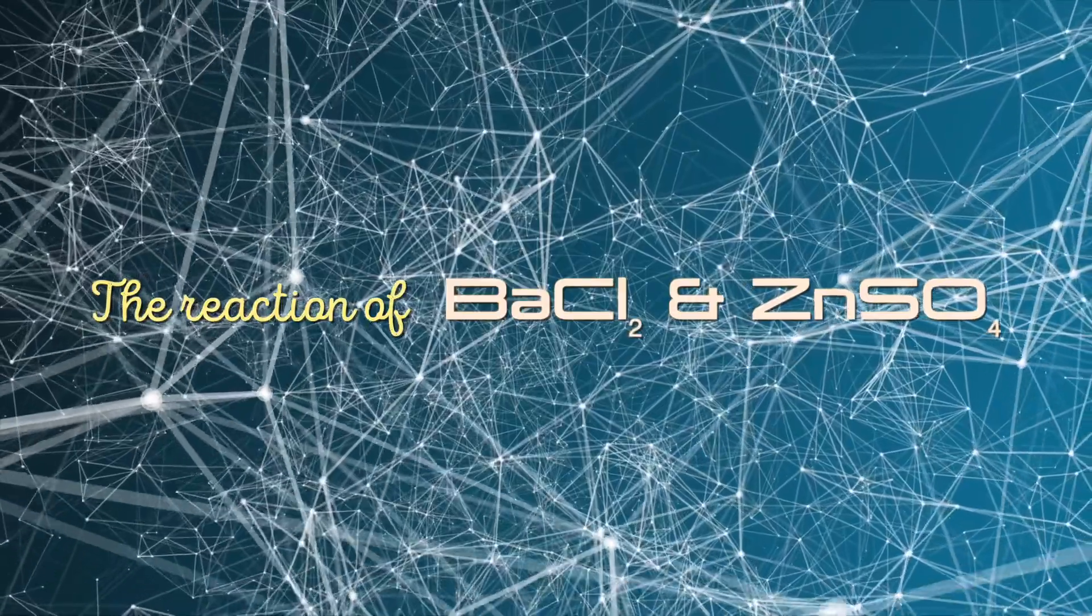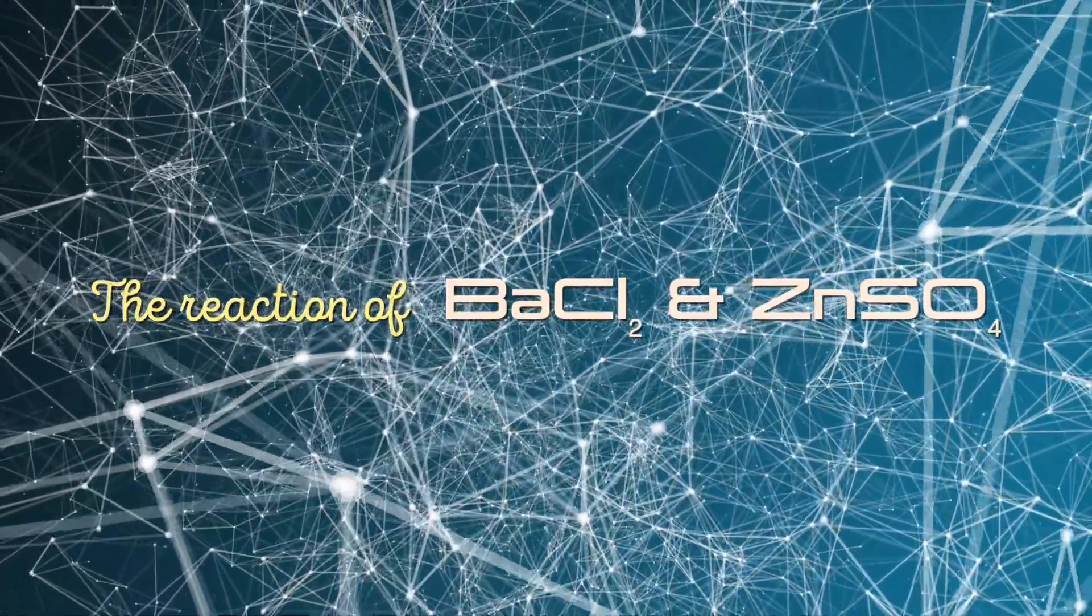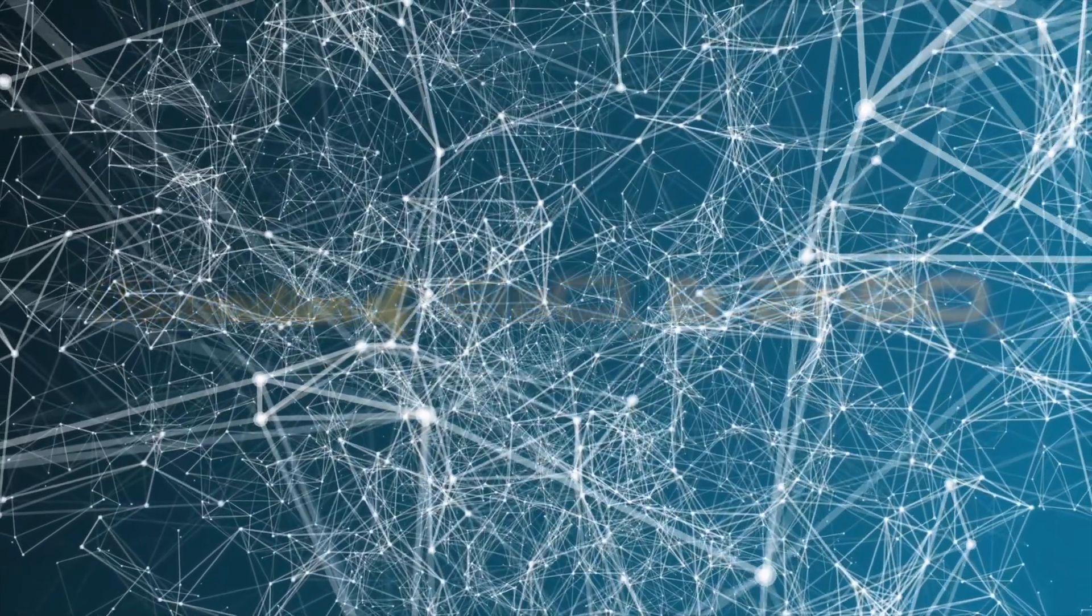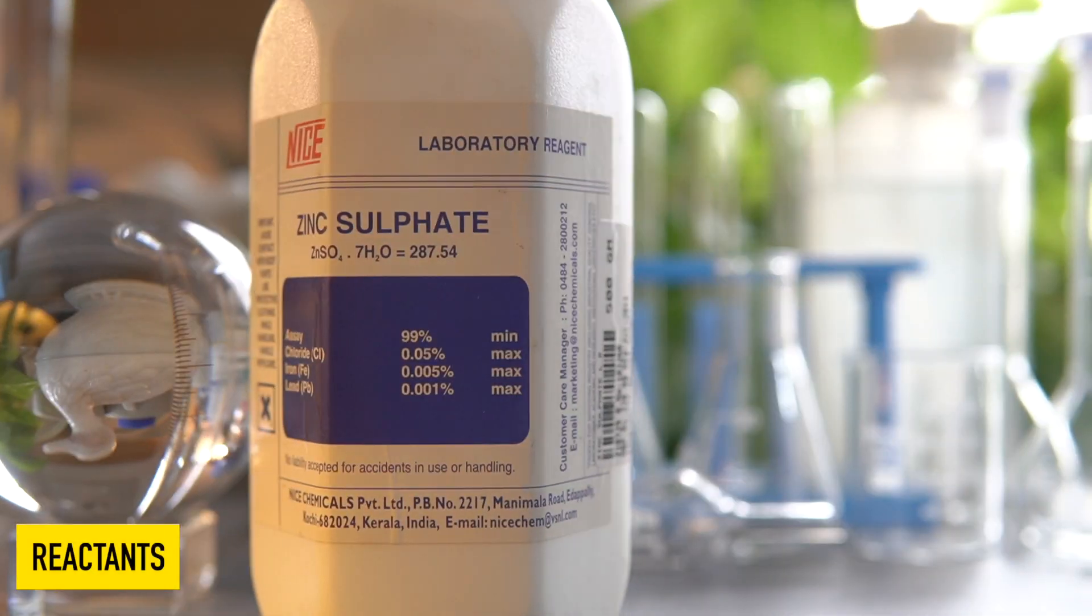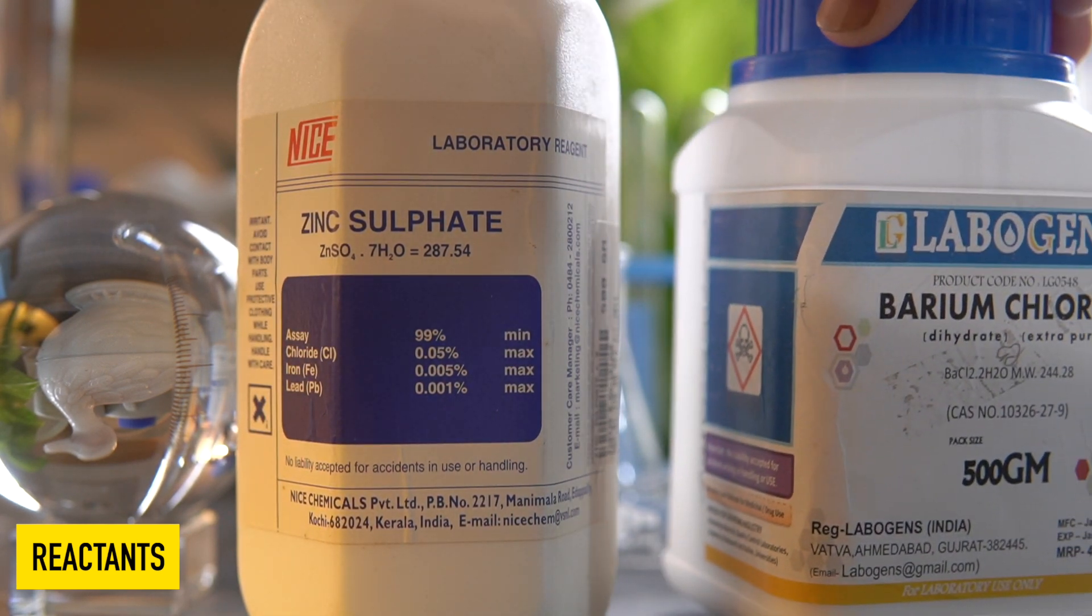Today we are going to observe the chemical reaction between barium chloride and zinc sulfate. The chemicals required are zinc sulfate and barium chloride.